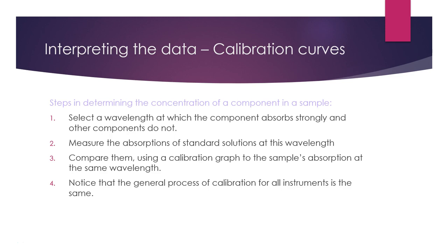The way we do this and the way we find quantitative data from this is to use a calibration curve. This is the skill that really is critical moving forward from here, this idea of creating a calibration curve, because we create it for many different types of spectroscopy and for chromatography. So what this means is that we need to set up a series of samples that will give us a straight line of which we can interpret and interpolate from in order to get the value. So run with me on this. It'll sound a little bit confusing at first, but it will make sense.